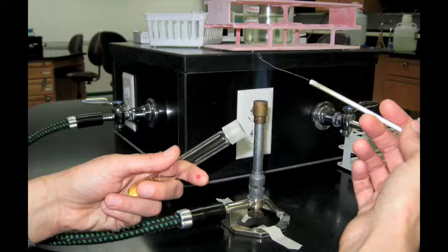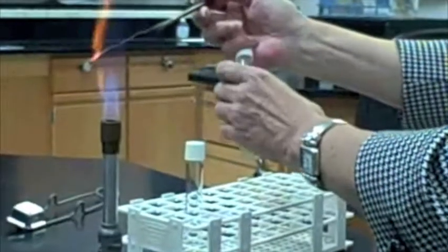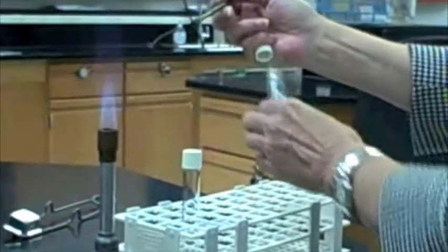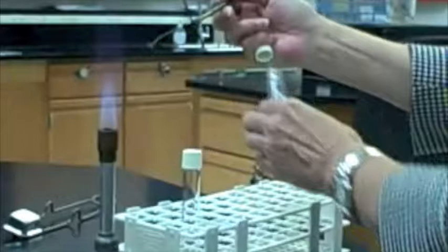Now, unscrew the top of the tube with the pinky finger of the hand holding the loop. Keep holding the cover with your pinky finger. Also, keep in mind that whenever you have tubes open, you should hold them at a slant to prevent contaminants from falling into the tube.